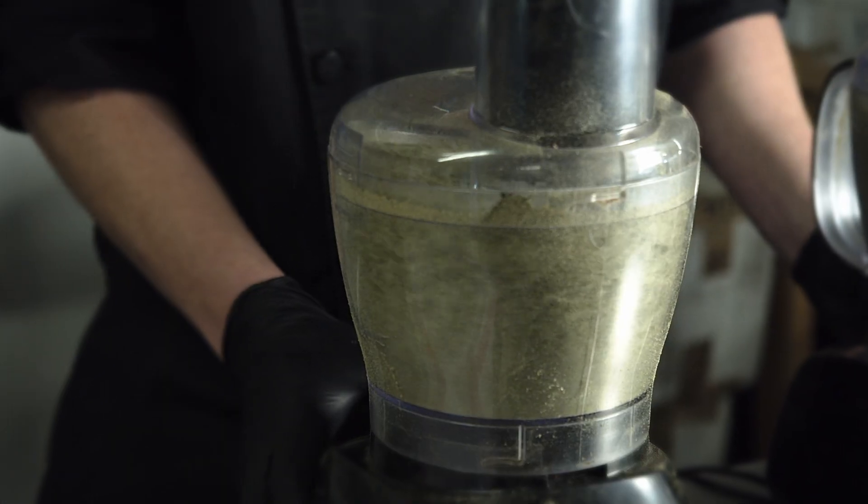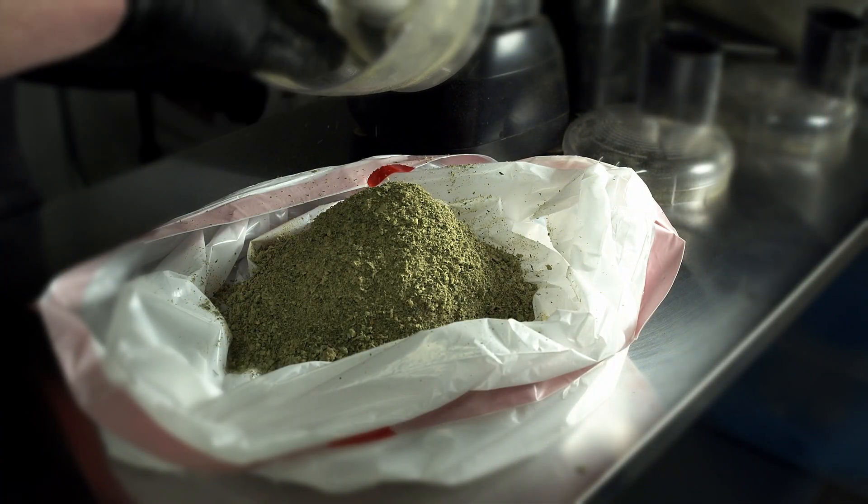We freeze all of our biomass as soon as it's brought into the lab. That allows us to preserve that full rich terpene profile. After the material has been frozen for a little bit, we grind it up and get it to a nice homogeneous particle size.